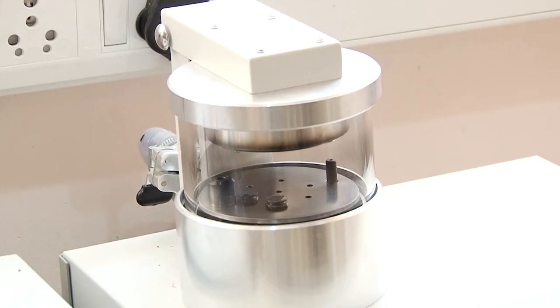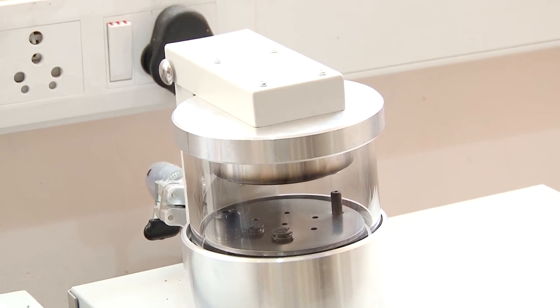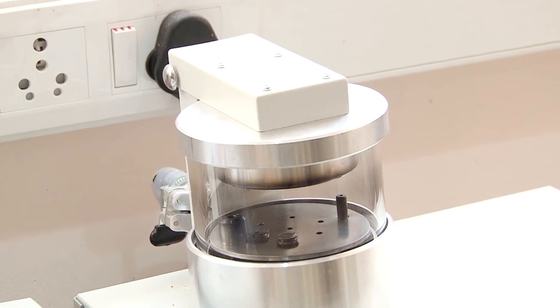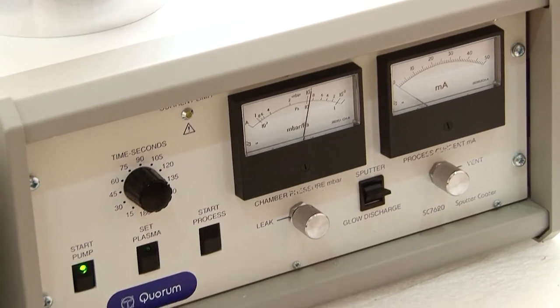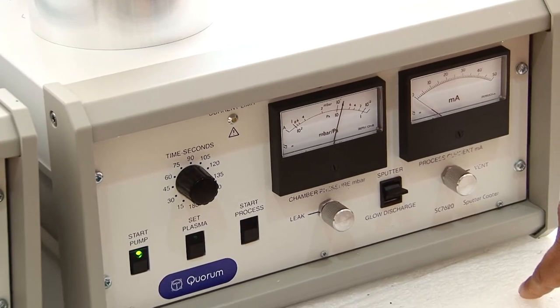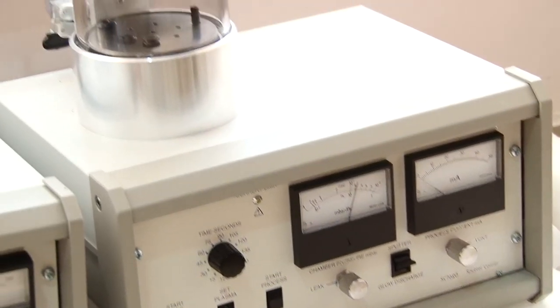Normally hair is a non-conducting sample, and for some analysis the sample must be conducting, so that the electrons could be grounded. If the electrons are grounded, then only will we get the secondary electrons for surface morphology. For this the current should be around 10 milliamps. Okay, let it start and I will go for this session.